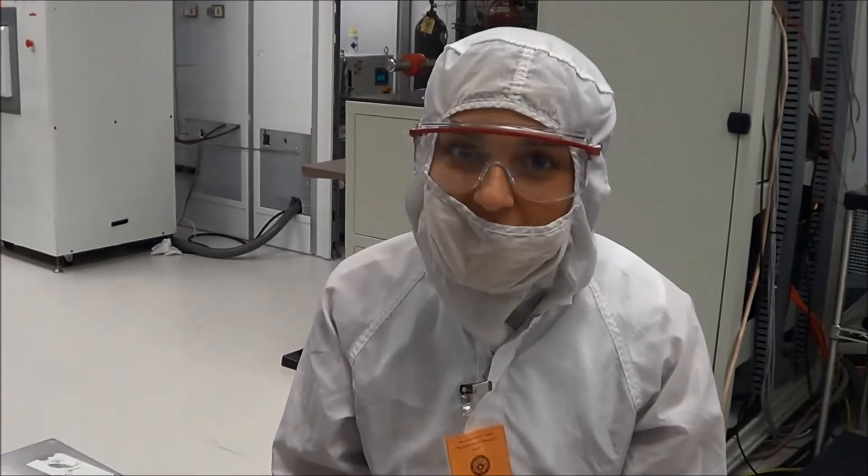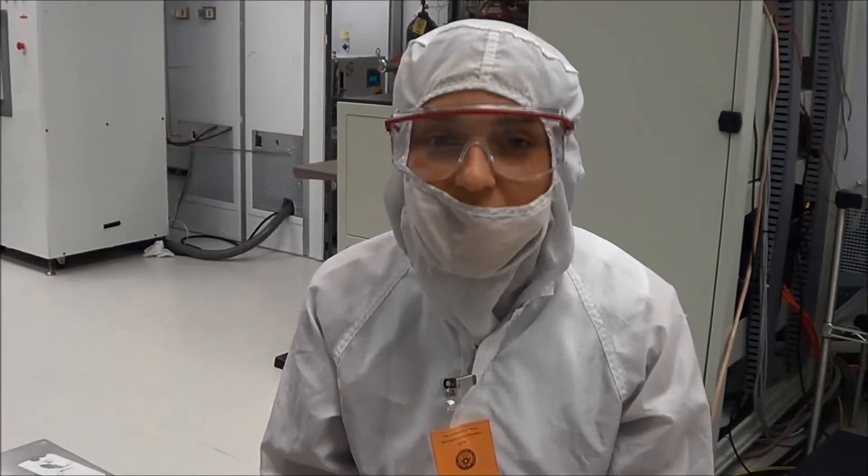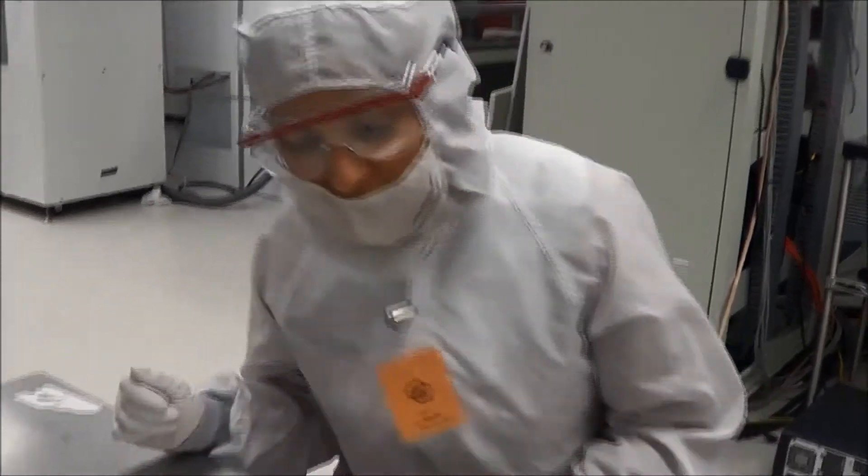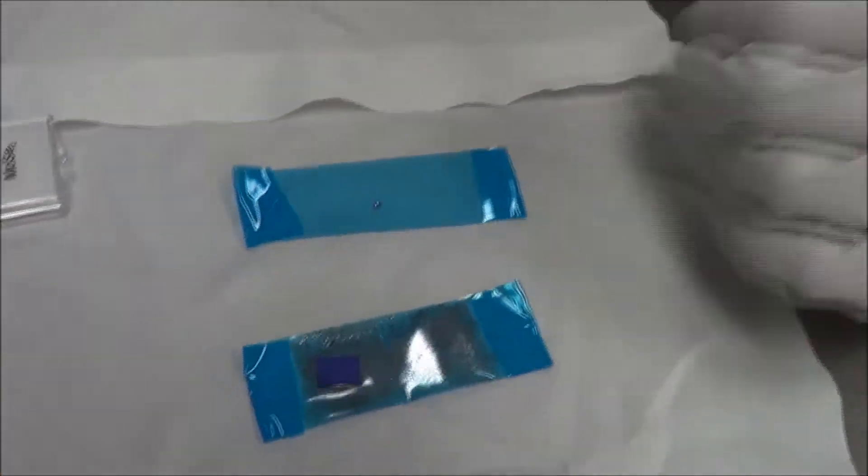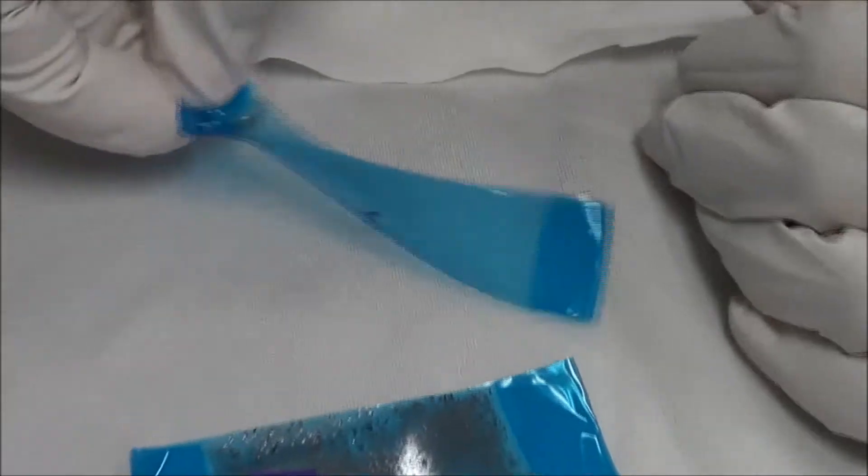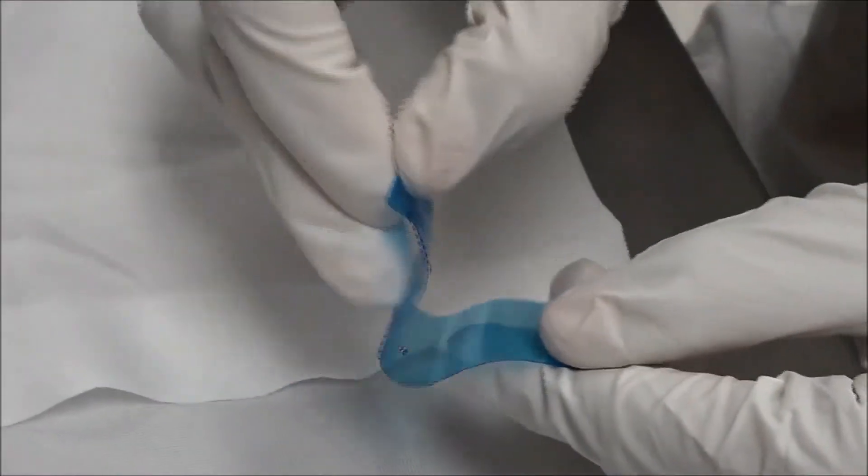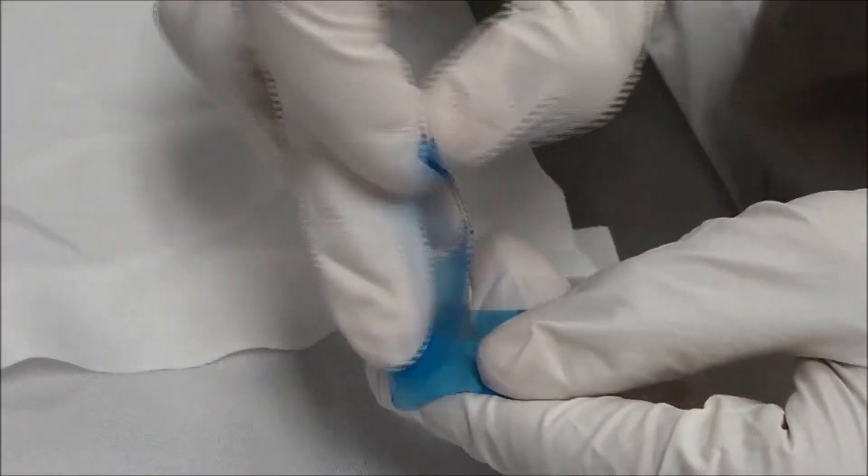In order to create a heterostructure, you need to achieve monolayer with each of your TMDs. To achieve monolayer, you take a small amount of bulk, place it on blue cleanroom tape and exfoliate simply by separating it layer by layer. Like this.